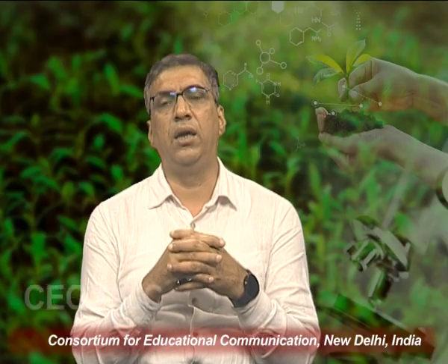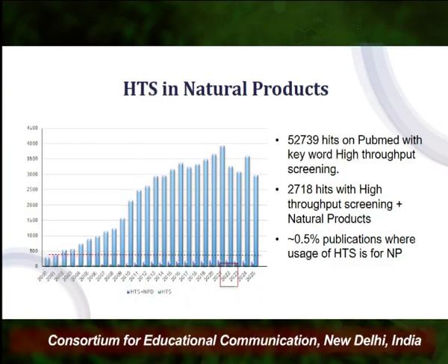Now we move on to the role of high throughput screening in natural products. We know that HTS is a technique that was largely used for synthetic molecules, but in the recent past we have seen that HTS is now gaining interest in terms of natural products as well. I have just displayed a graph wherein the data of the last 25 years is presented.